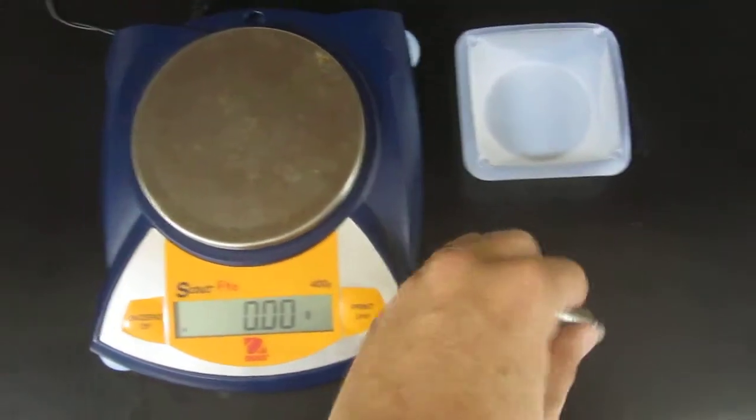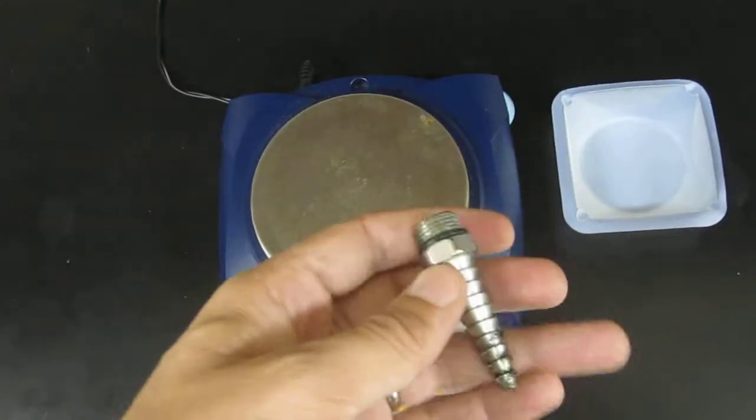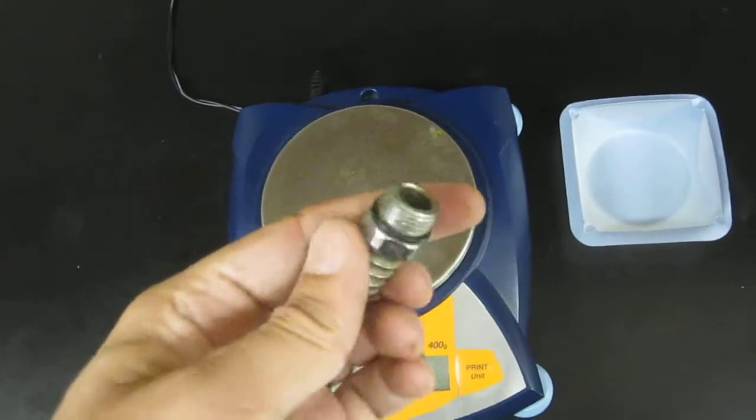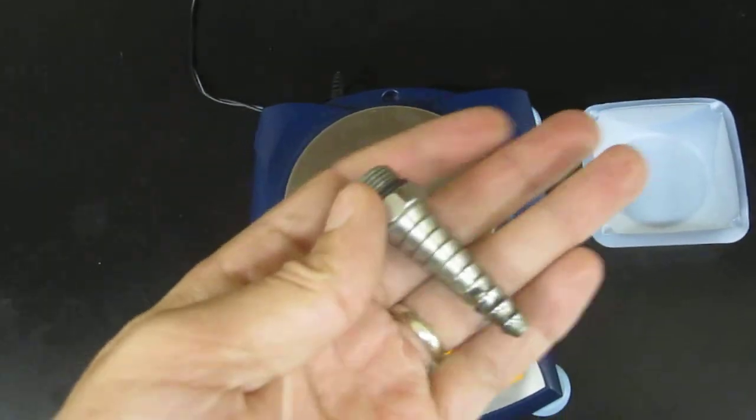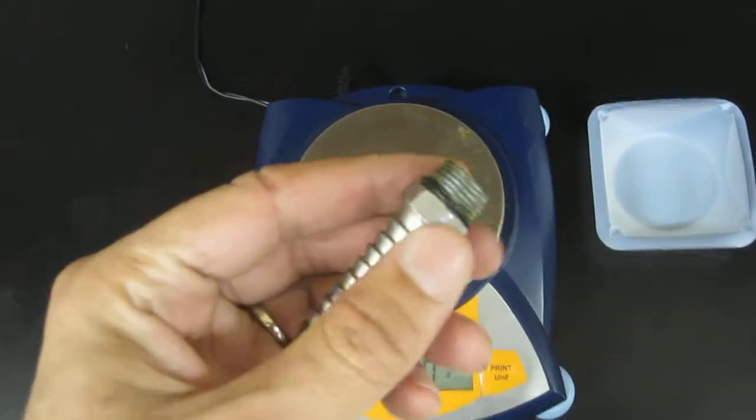So the first step in finding the density of an irregular object is to weigh that irregular object. So here is our irregular object. As you can see, it is quite irregular.